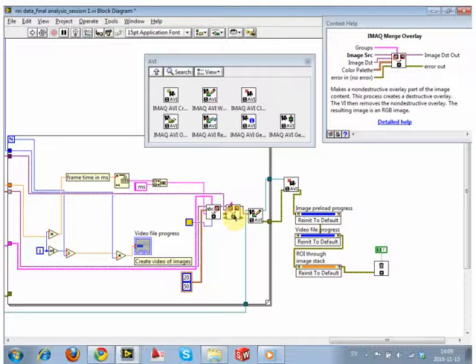You can have as many overlays as you want. And there are lots of occasions where I will use like 15, 20, 30 overlays for text, for lines, for boxes, for data points. I mean, you can have an awful lot of overlays. And then at the end, you merge them all together, and then you can stitch it together in the video.